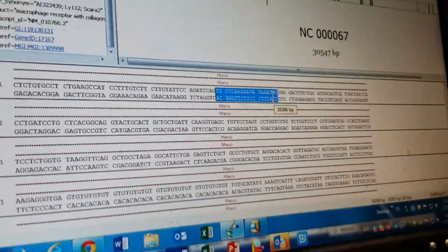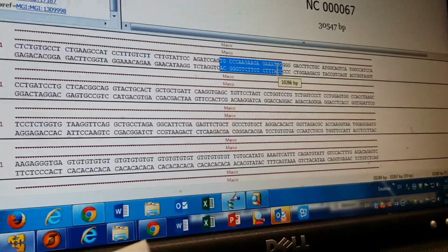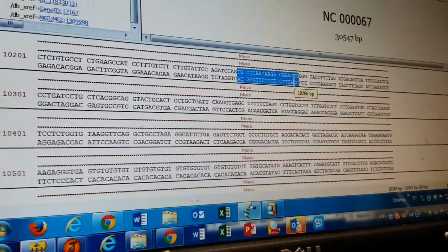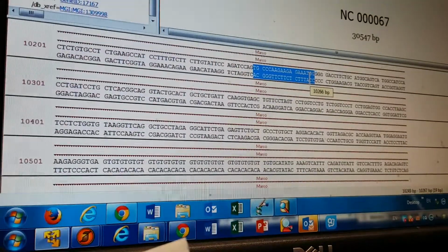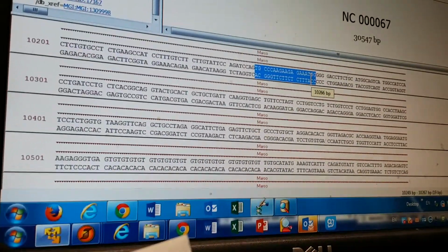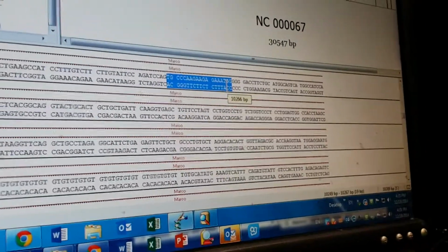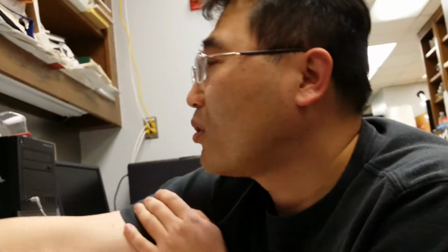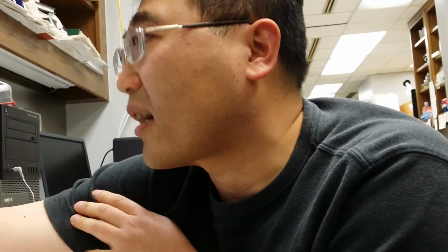plasmid, and then make the plasmid, and then put the plasmid into ES cells, and then put in the donor DNA. What's the donor DNA? You can put a selection marker, a new gene, whatever, to replace this one, to add a selection marker. And this might knock out this exon. You can even knock out the whole thing. How would you knock out the whole thing? Just the same thing. You use homologous recombination, and put the homologous sequence at this end and that end. But for CRISPR it may not be efficient. CRISPR usually knocks out the place that is targeted.